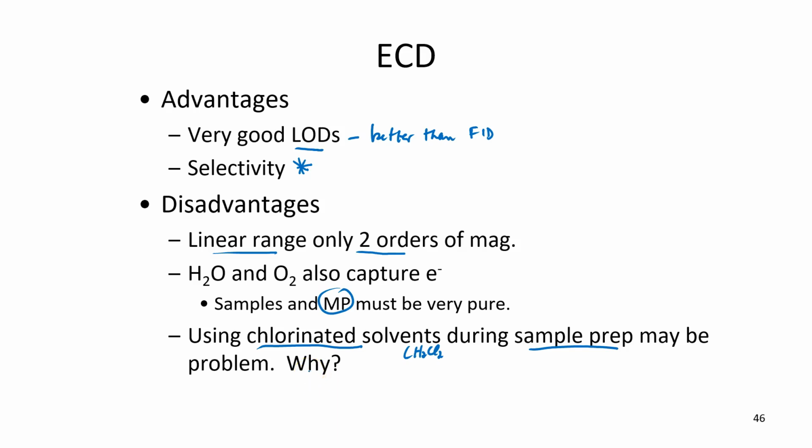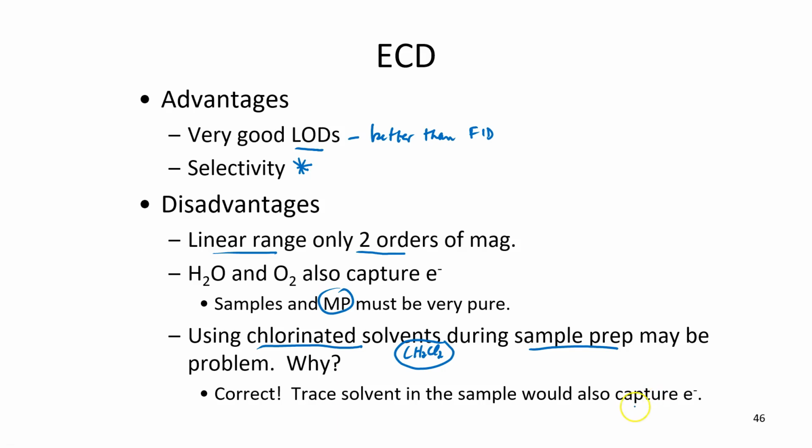And the question is why? Well, if you have any traces of this solvent in your sample, it would also capture electrons and maybe give you a false positive. So that's it for the ECD.